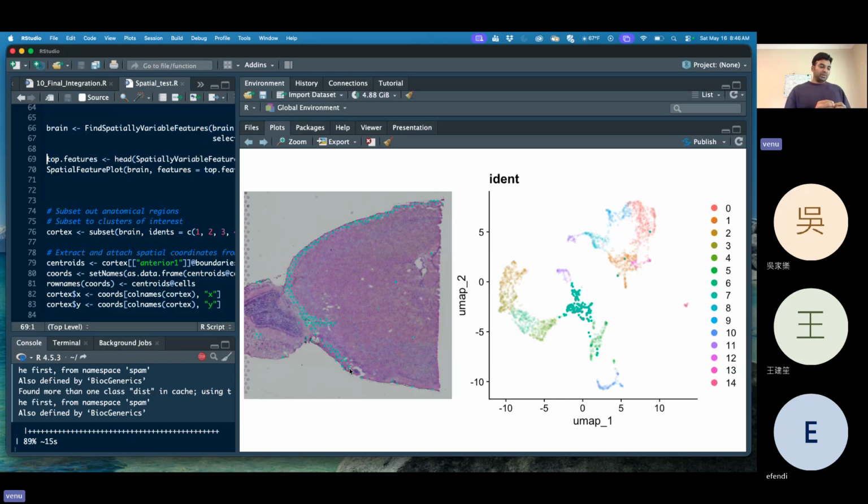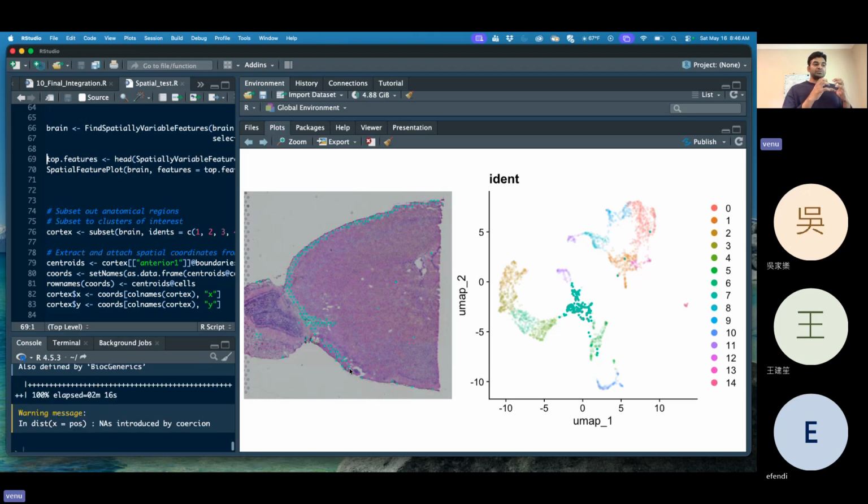They are all kind of different. You know, the TME is very complex, so we can see cell interactions there. For suppose epithelial cells are closer to the CD4 cells in the outer layer. That is a biological thing, and if we dive into this, that is what we can observe. Each spot may have 1 to 10 cells, and based on top expression there is also a second layer.